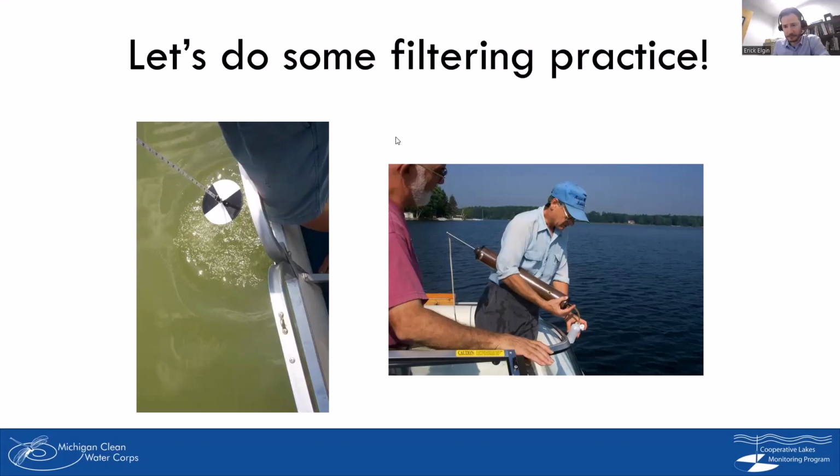Perfect. Richard in the chat says some freezers have a defrosting cycle. Does this affect the integrity of the samples we collect? Those filters have to stay frozen, or biological productivity will possibly continue, and the algae will continue to grow on the filters. I don't know freezer engineering.